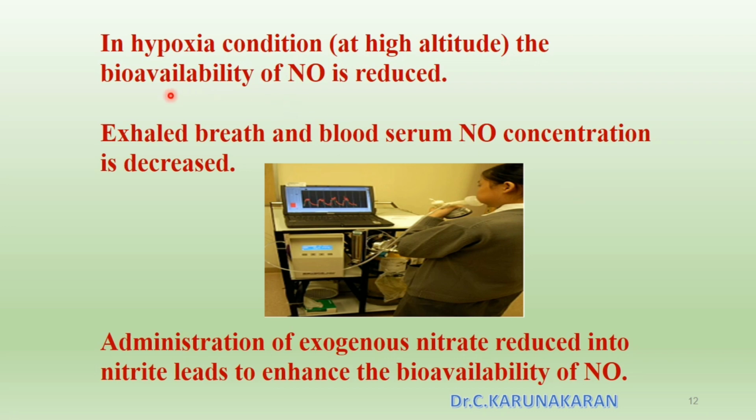There is only one method available presently for detection of NO, that is chemiluminescence, commonly used in DRDO, and the Griess method. The Griess method is an optical method using a UV-visible spectrophotometer.